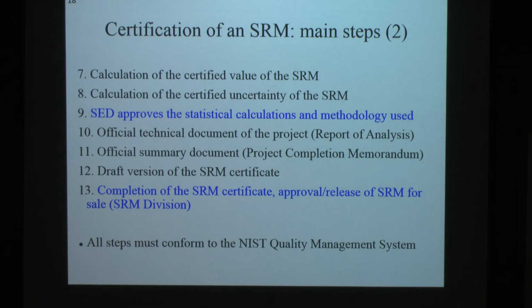The certificate I showed before for the borax SRM, the certification measurements for the newest batch have been completed. The value is there, the certificate and all the paperwork is at this stage here, and right now the previous batch, the one I just showed here, is out of stock. You can't buy it. People are out there saying, we want to buy. We need the standard reference material to check our pH measurements at pH 9.2. And we're still waiting for it to come out.